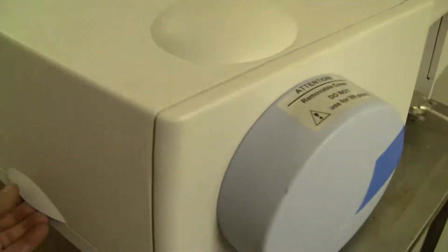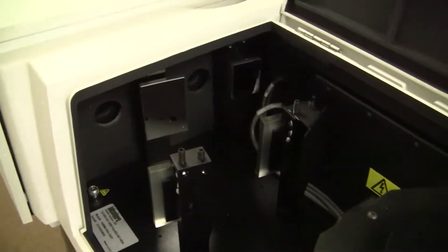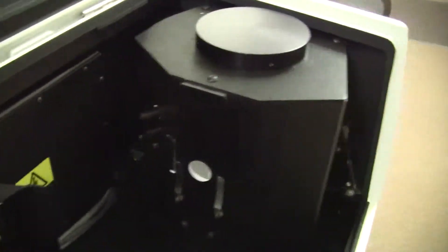Let's take a look at the sphere itself. This is where your sample goes. Inside — very white, very nice.